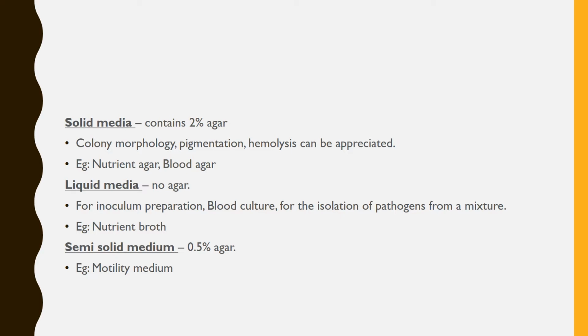In the liquid medium there is no agar. Liquid medium is used for inoculum preparation, blood culture, and for the isolation of pathogens from a mixture. An example is nutrient broth. Semi-solid medium has 0.5% agar, and semi-solid medium is used to check the motility of the organism.